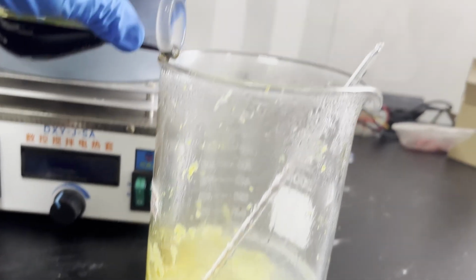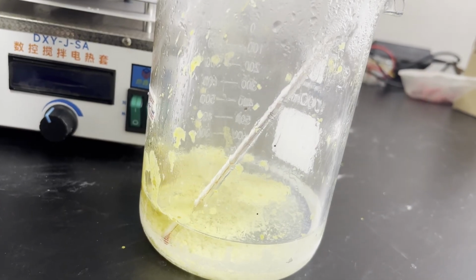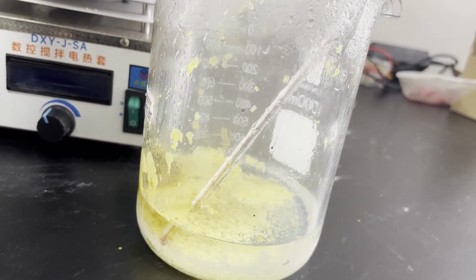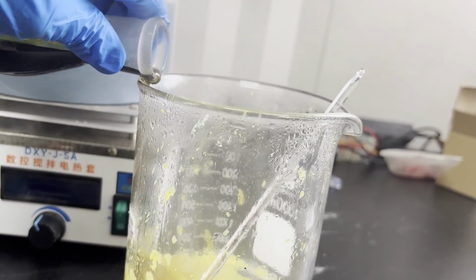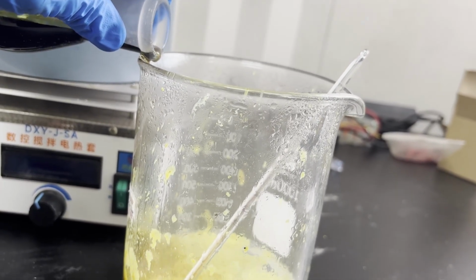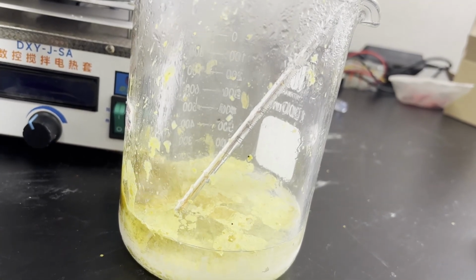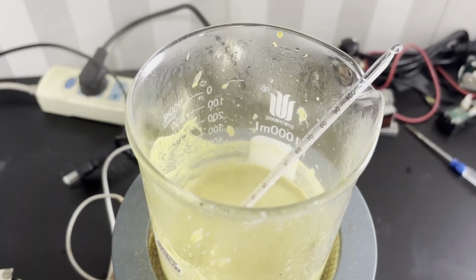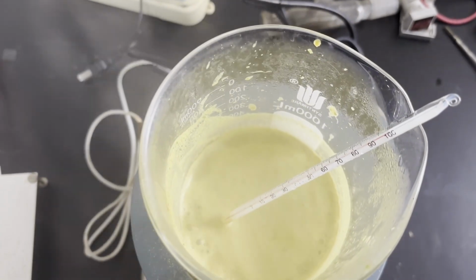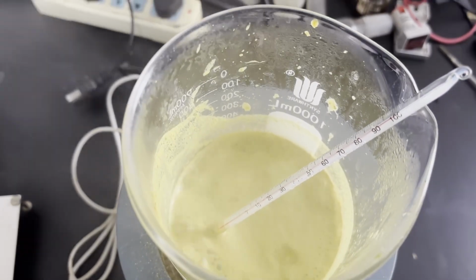Now I'll explain why I deliberately used hot water instead of the much safer cold water. The conventional workup procedure of such reactions with concentrated sulfuric acid uses ice water as the exotherm is well controlled, but this reaction is special in that some sulfonated acridone byproduct is formed, which can be hydrolyzed back to acridone in boiling water. Thus, using hot water instead of cold water can increase yield while conserving time of heating the solution up again. After all the reaction mixture is poured into water, the large beaker is placed on a heating mantle to boil its contents for 5 minutes, serving to hydrolyze any sulfonated acridone as mentioned before.